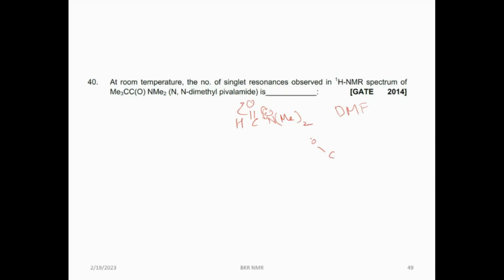Same story here also. So I have C double bond O, and this C is attached to carbon with Me thrice.